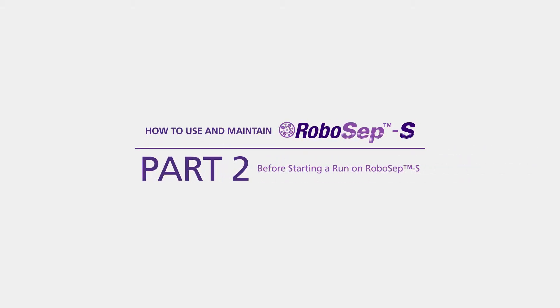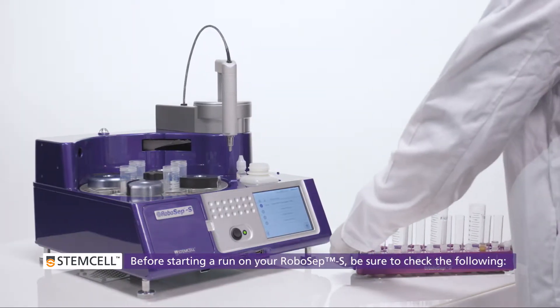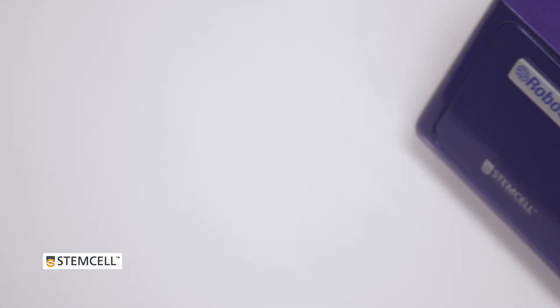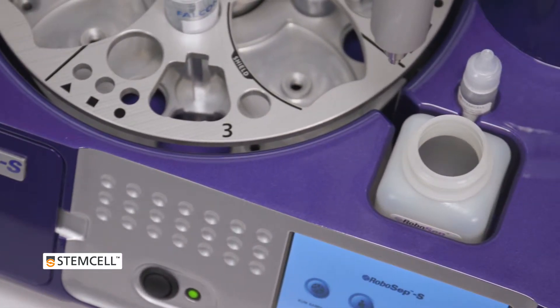Part 2: Before starting a run on RoboSep S. Follow these steps before starting a run on your RoboSep S. First, ensure the hydraulic fluid bottle is at least half full. This will ensure that the machine's hydraulic system doesn't dry out, which would affect pump accuracy and performance.